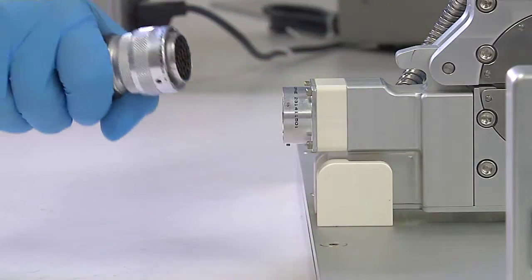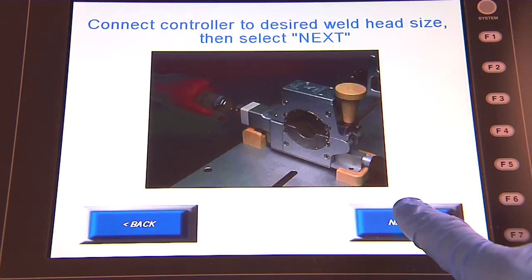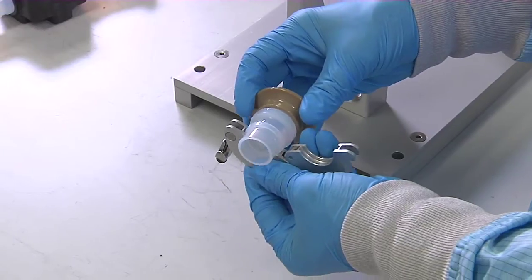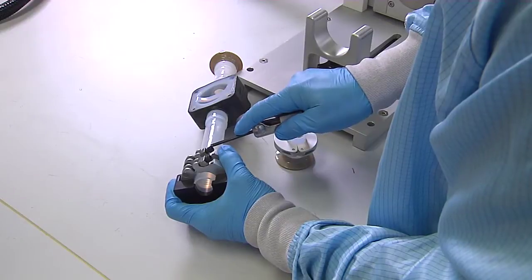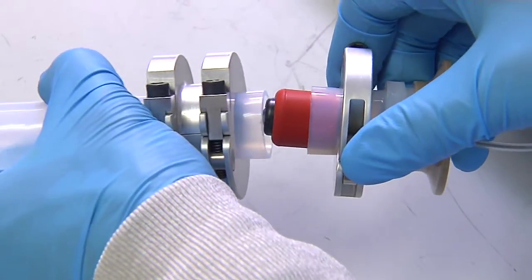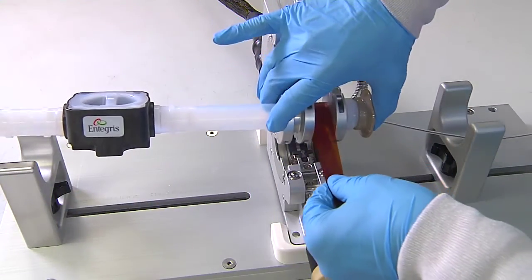It's never been easier. The control module automatically detects the size of the component being welded together and selects the proper welding parameters — no need to be an expert. The clamps, gauging tool, and weld head offer easy weld setups, while the patented insert maintains the inner diameter of the tubing during the welding process.